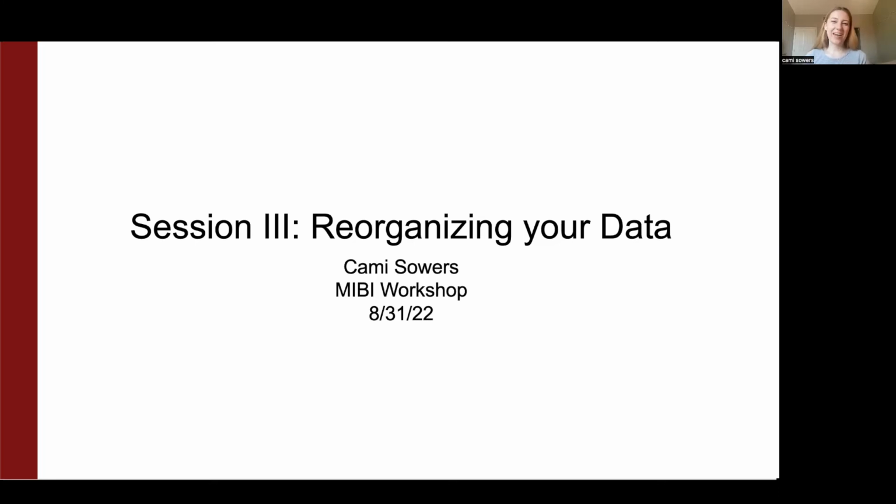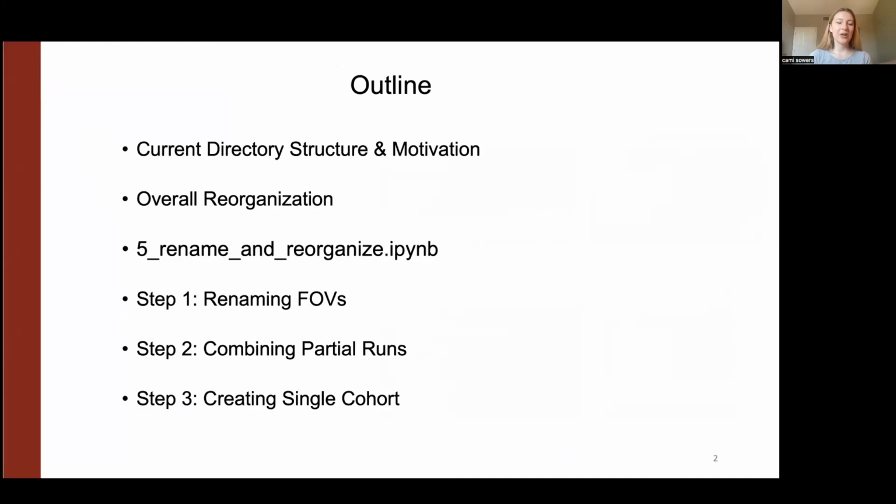All right, so I am going to be talking to you about the final step in the toffy pipeline, which consists of reorganizing your data. So first, we're going to talk about the current directory structure and a little bit about the motivation behind why we want to reorganize things. I'll show you the overall reorganization that's going to be happening before we dive into the actual notebook.